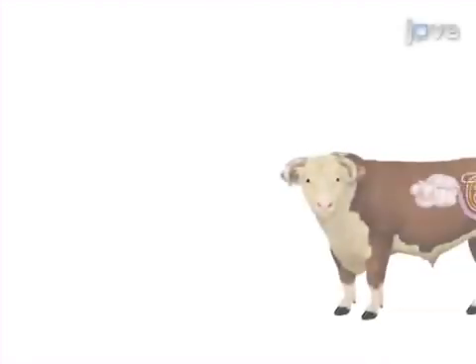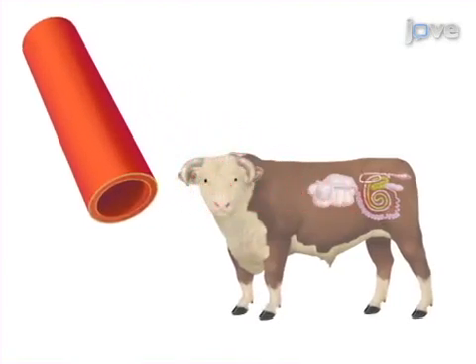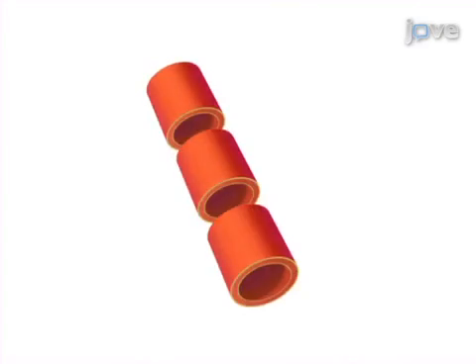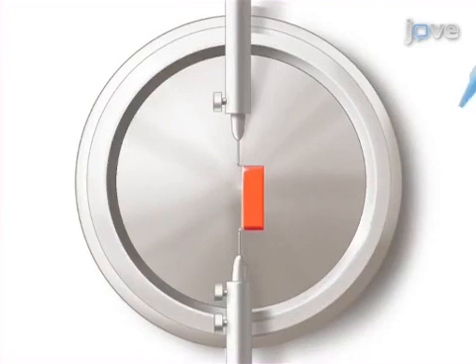This is accomplished by first collecting a mesenteric tissue sample from the animal. In the second step, the sample is cleaned and the vessels are sectioned. Next, the sections are mounted and equilibrated on the myograph. In the final step, the isolated vessels are exposed to the compounds of interest.